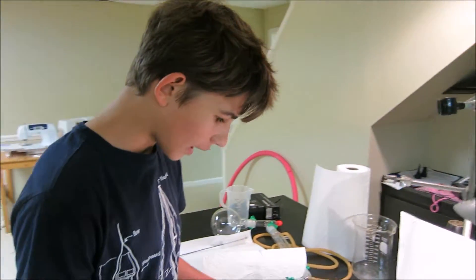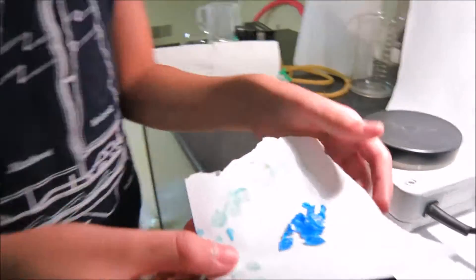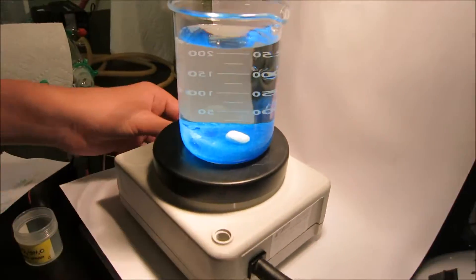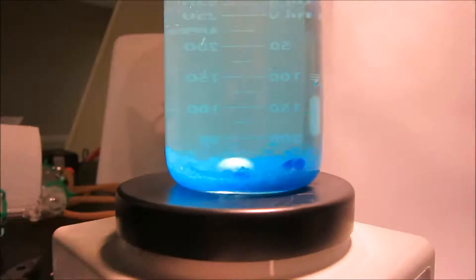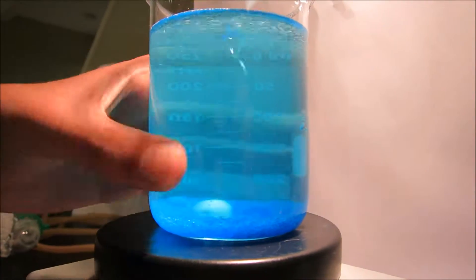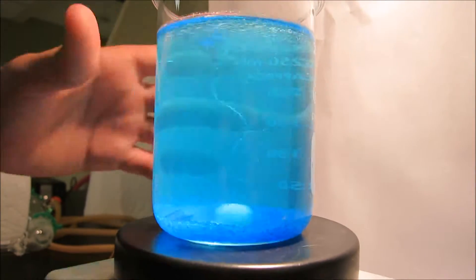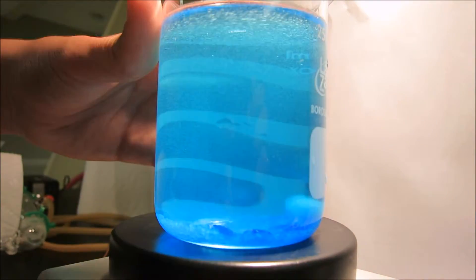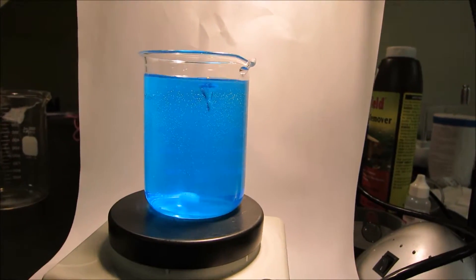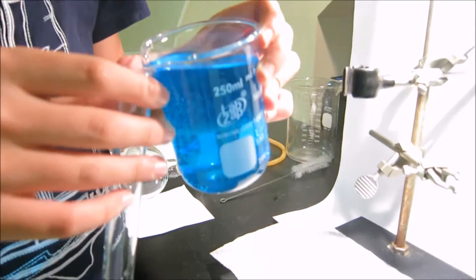We will be doing the electrolysis of copper sulfate. Let's start by dissolving the copper sulfate in water. Here I have some crystals I have previously recrystallized. Now all the copper sulfate has dissolved, so let's pour it into this test tube.